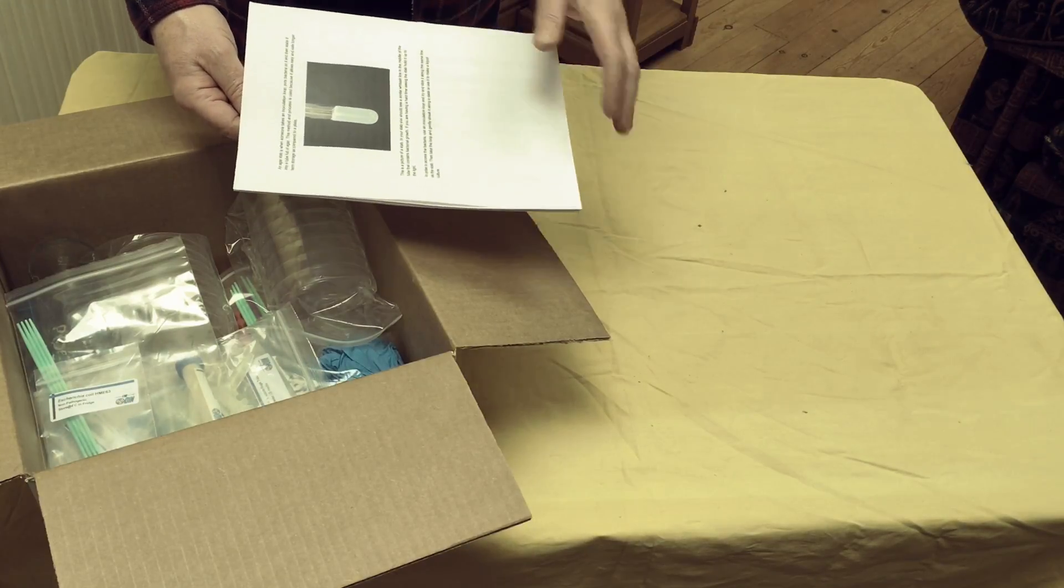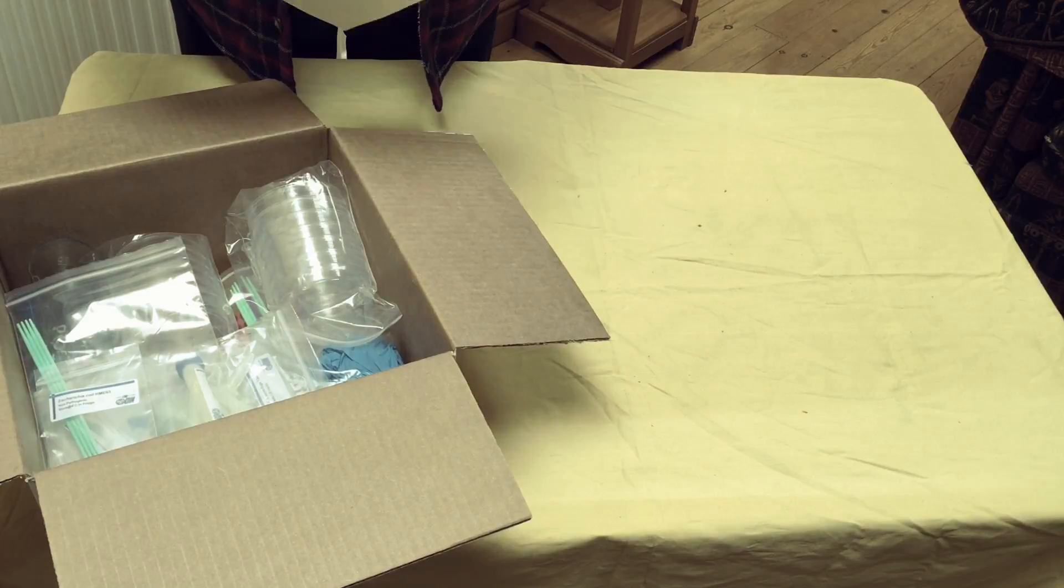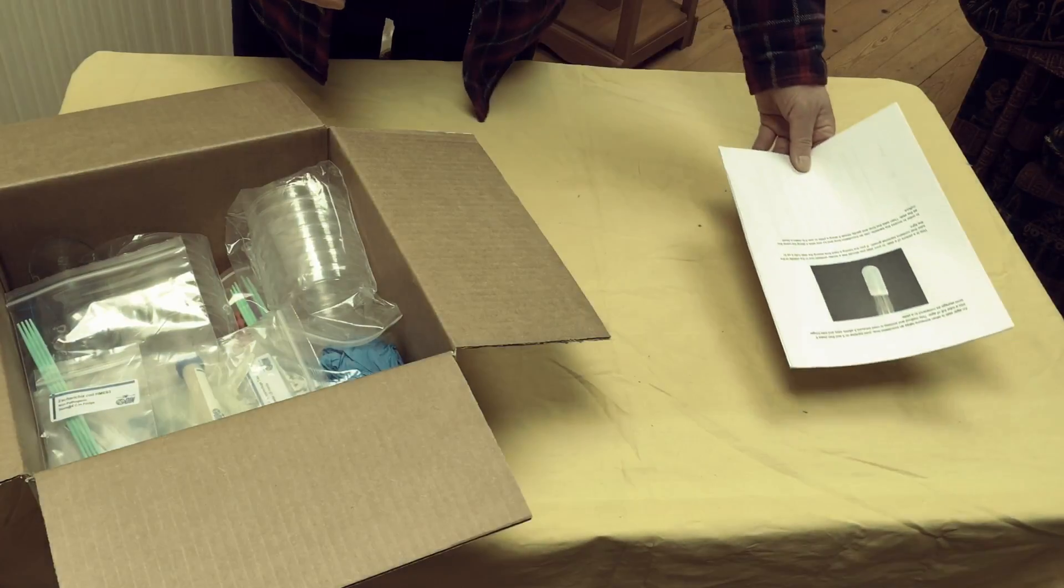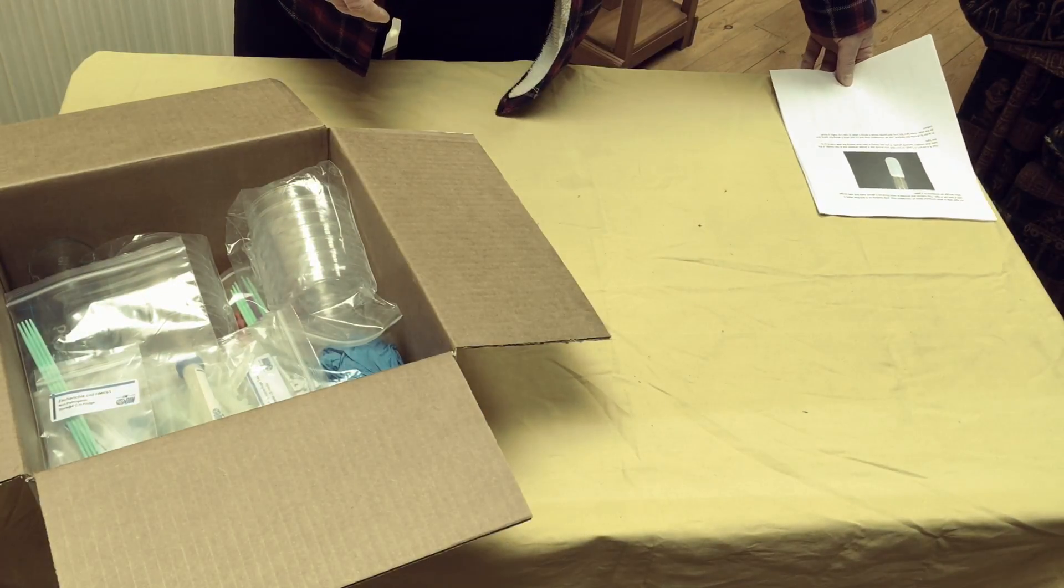And as well as the sample experiment, it says it contains enough for five experiments in total. So put those there.